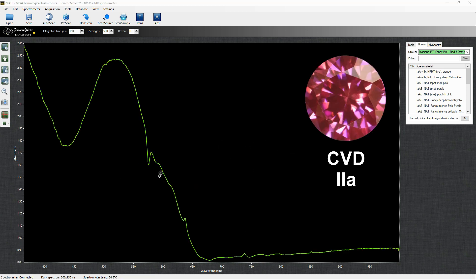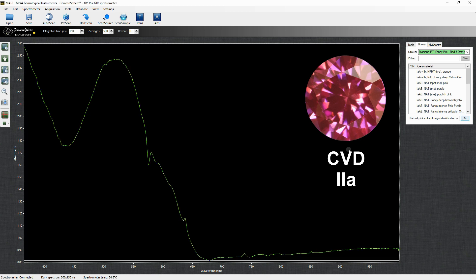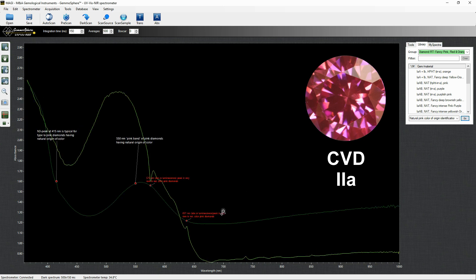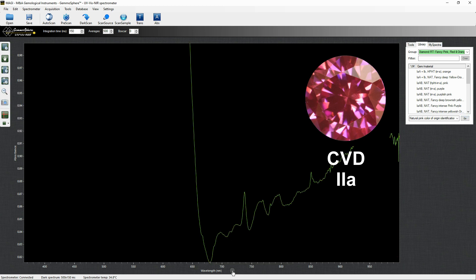In CVD pinks we can see the same defects causing the color. The presence of the silicon vacancy defect at 737 nm is an indicator of the CVD-grown process.